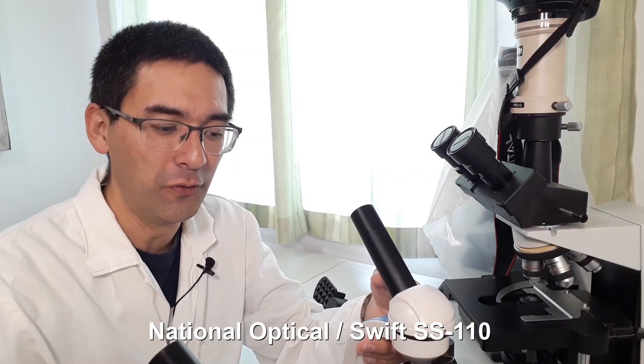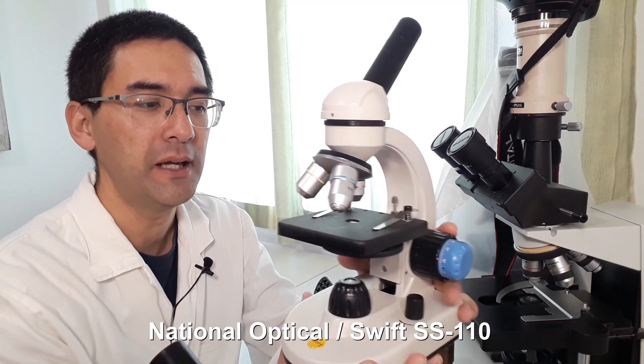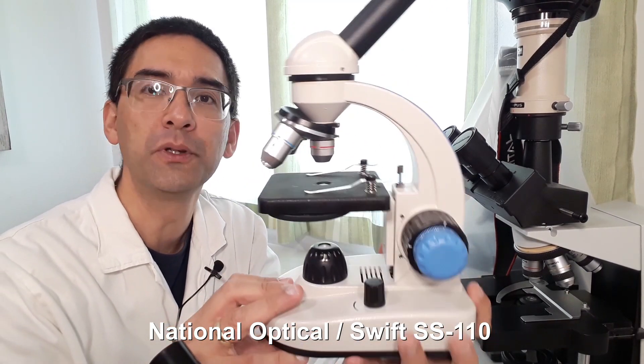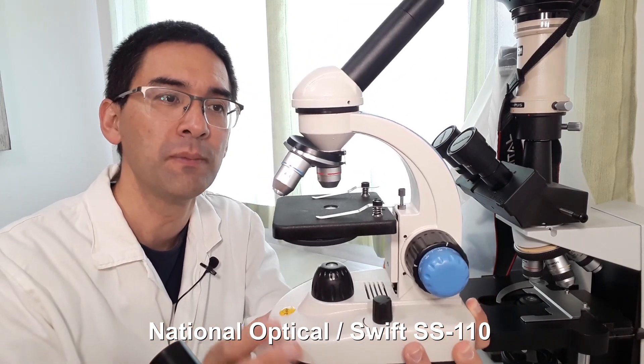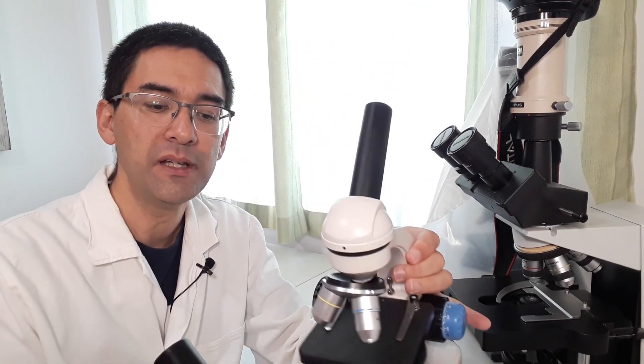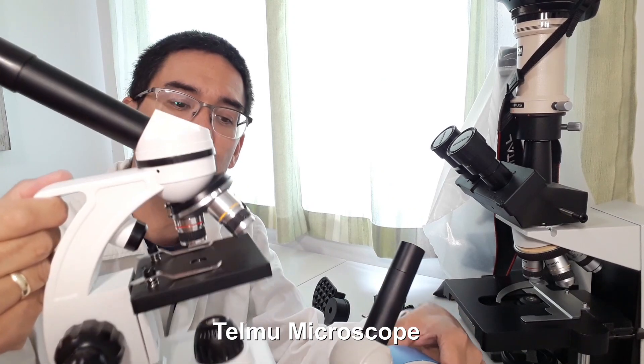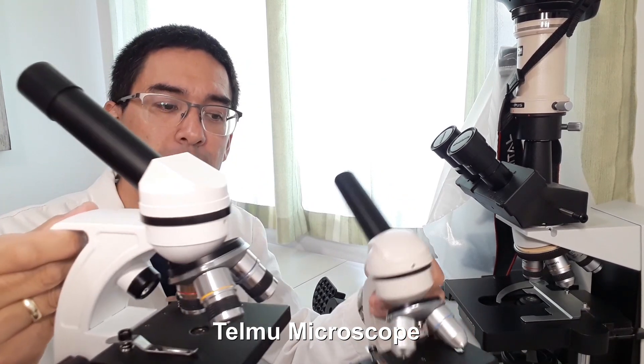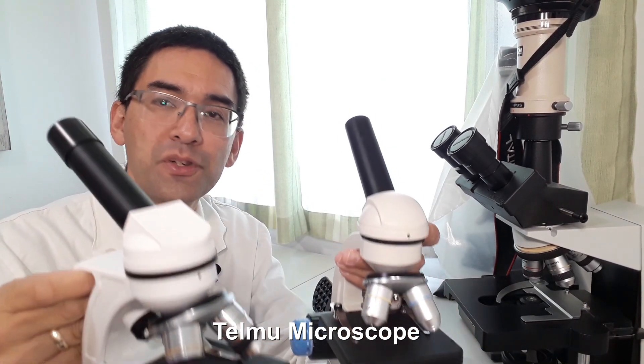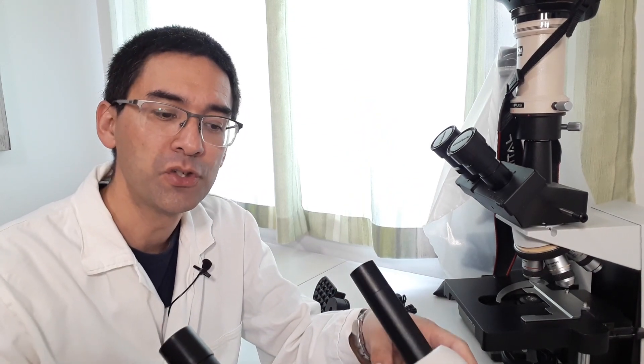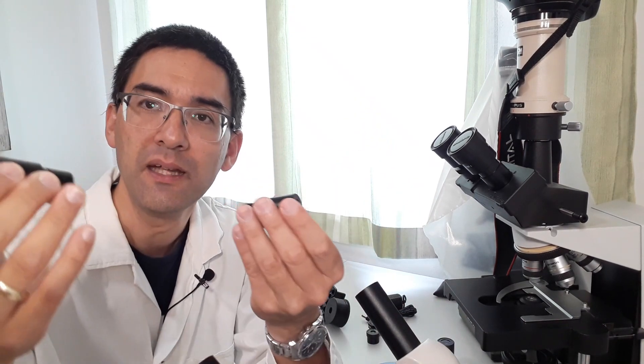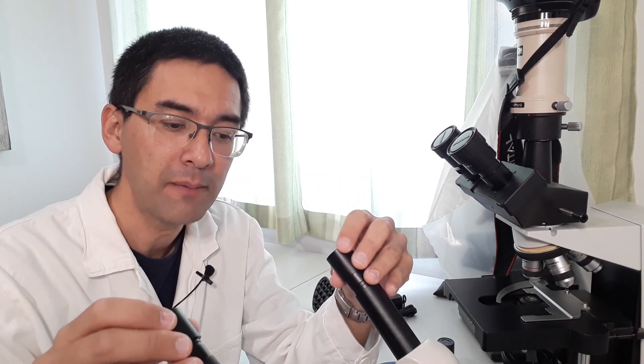First of all, the microscope here is one from National Optical or also from Swift. It's branded a little bit differently in different countries. And this one here is from Telmu. Both of them are similar in the sense that they have the same magnifications. Both are supplied with 10x eyepieces and also 25x eyepieces.